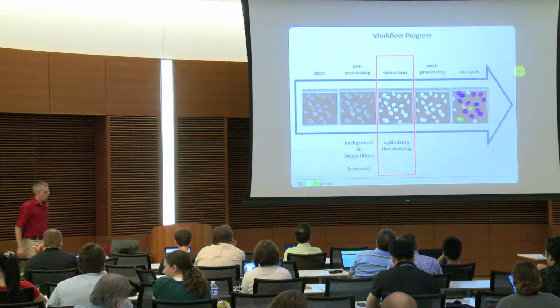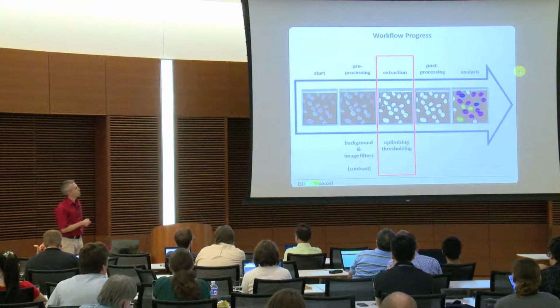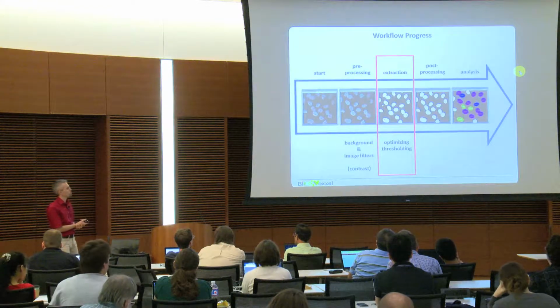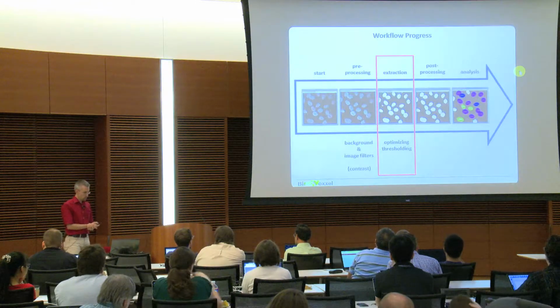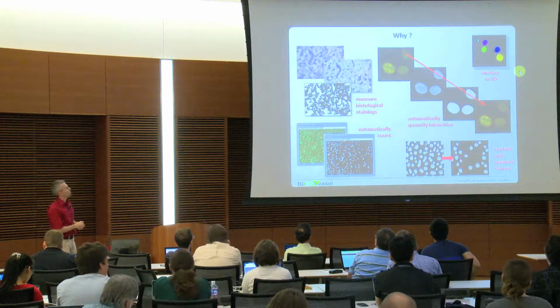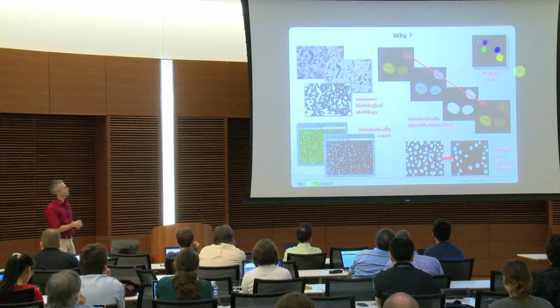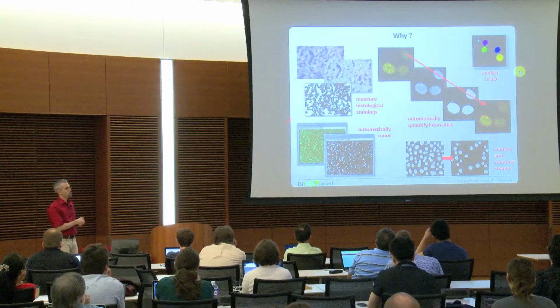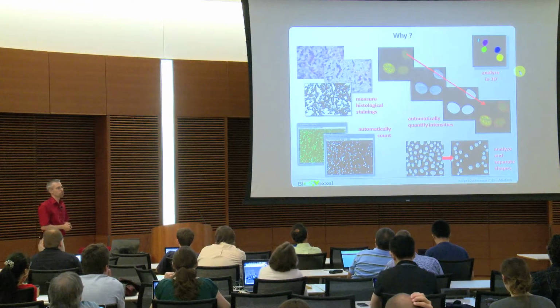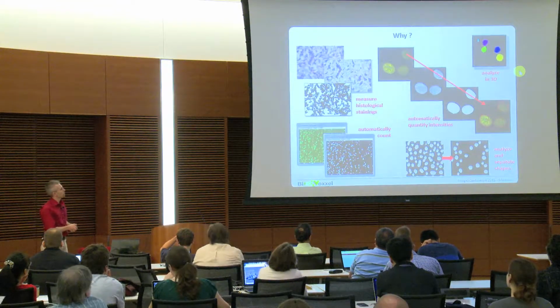So, to continue, now we're coming actually to the little bit more difficult task, which is the extraction of the objects, and especially doing a reliable extraction, which is not always possible and is not always easy. Why are we doing that? Because no matter if we have true color images with different colors or intensity-based images, we can extract colors of interest or intensities of interest and then later on quantify, for example, a positive area. We can quantify colonies or cells and count them later on.